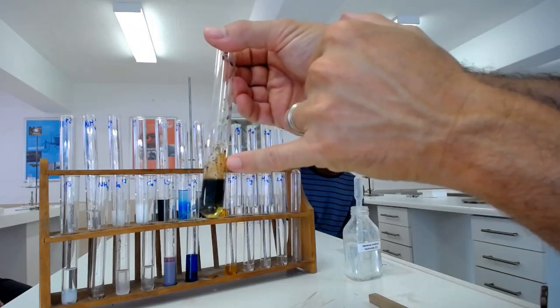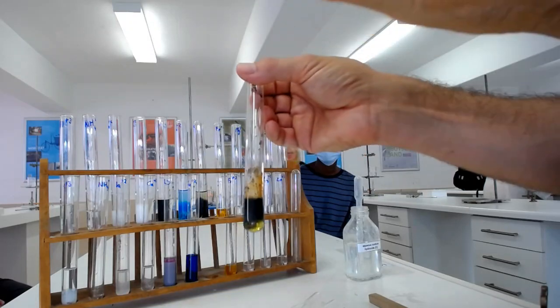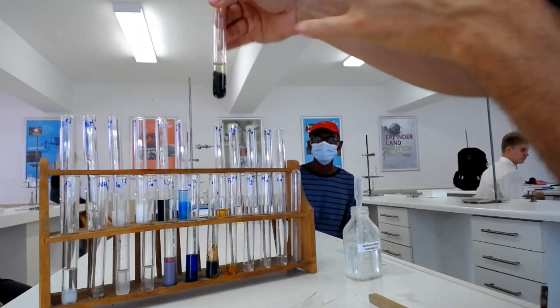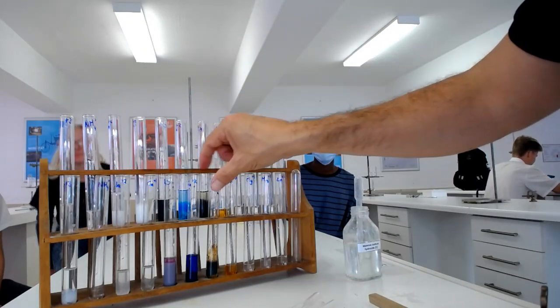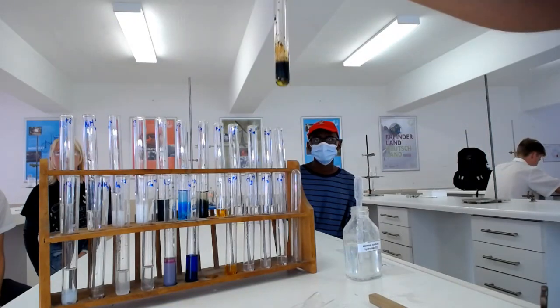Why? It's reacting with oxygen. So what do we call that? Oxidation. Yes! You're brilliant! And you'll see this happens really fast. This one is slightly slower, but it's also going to turn brown. So very, very nice. So look at the rust. That's literally rust that it's dragging down.